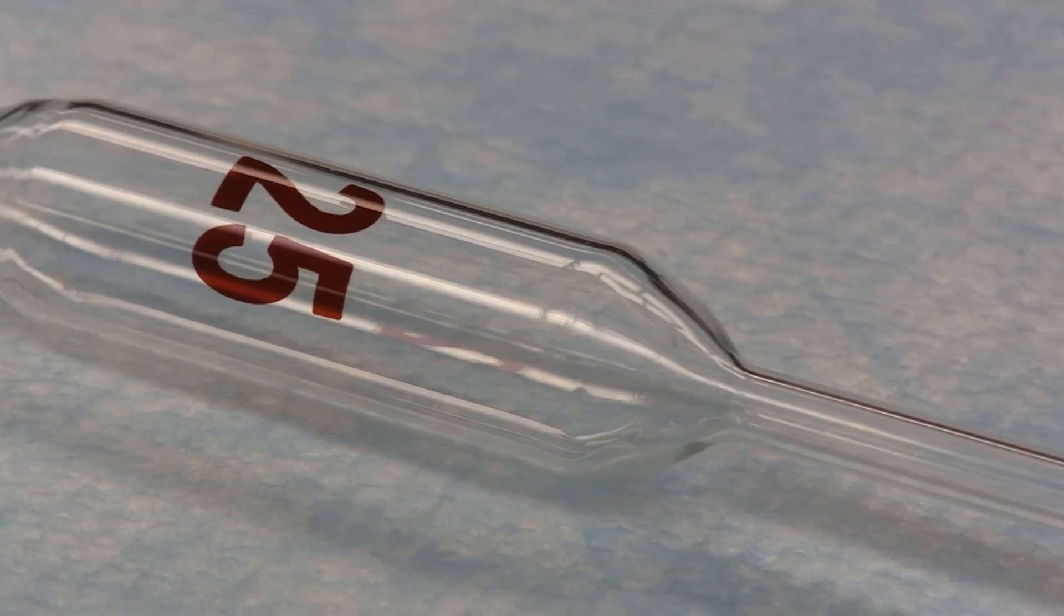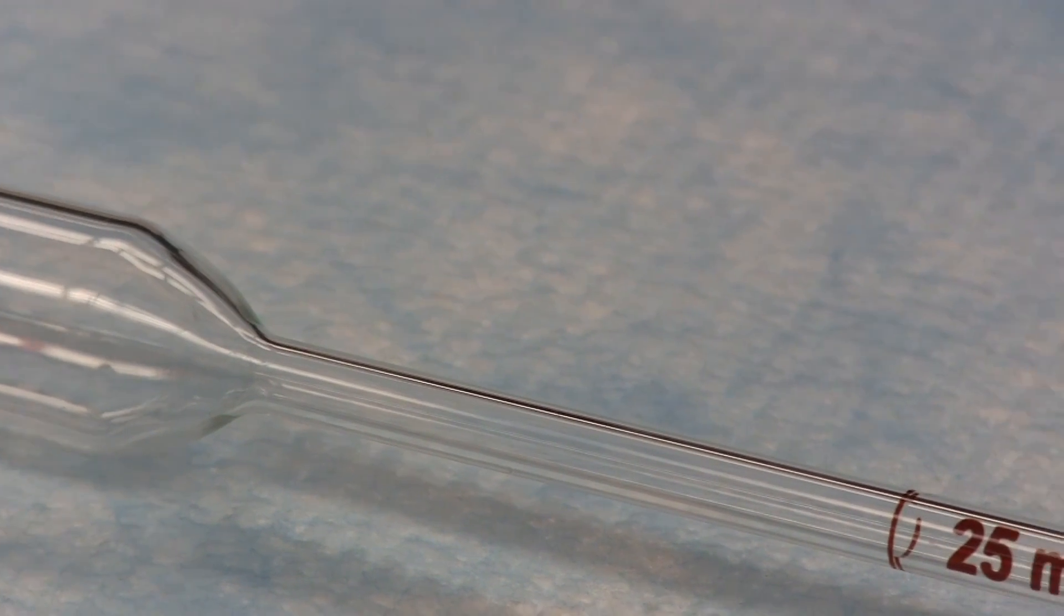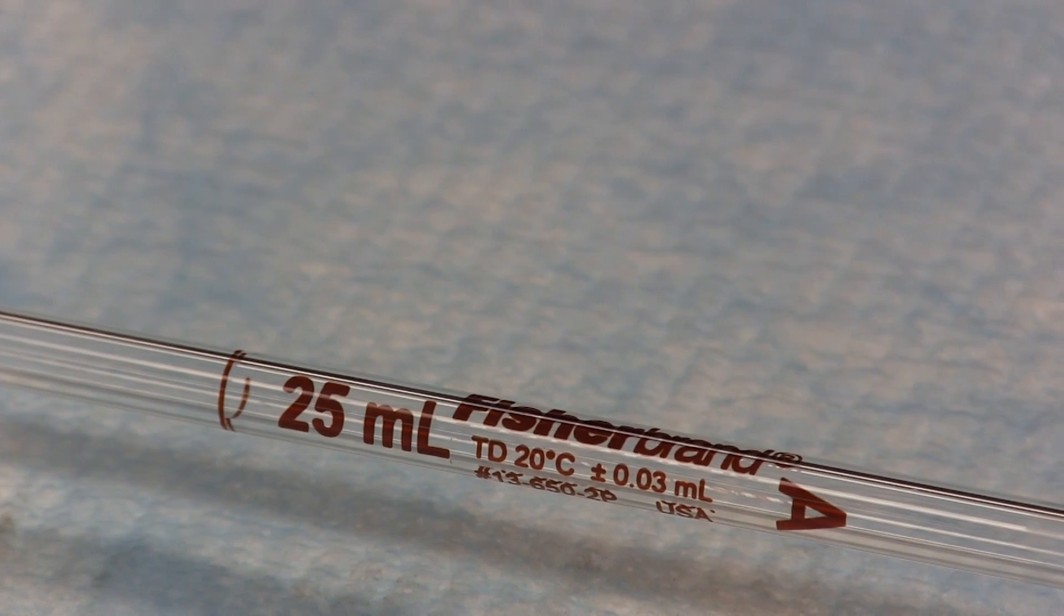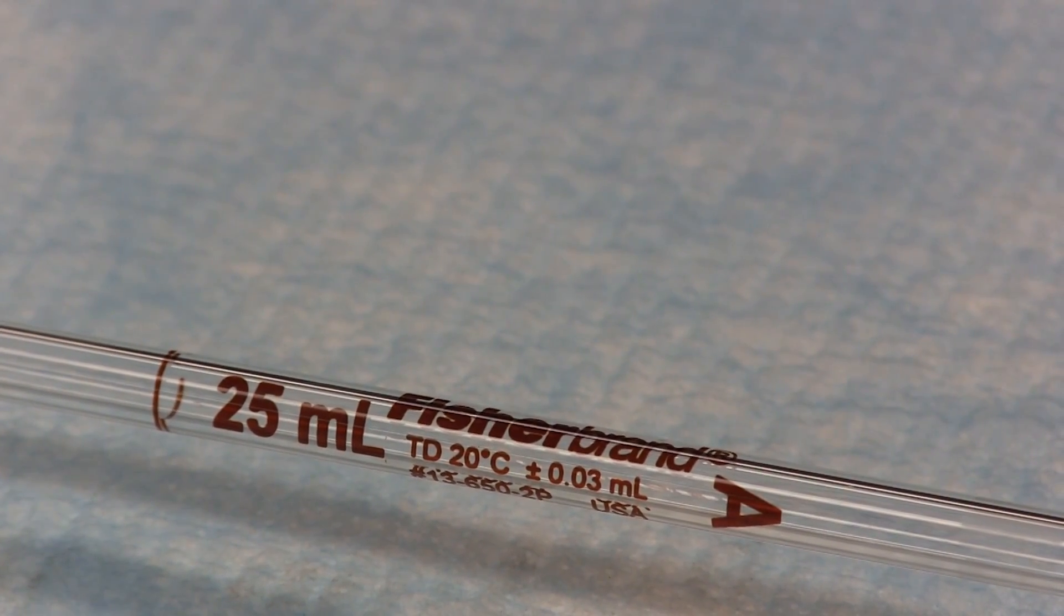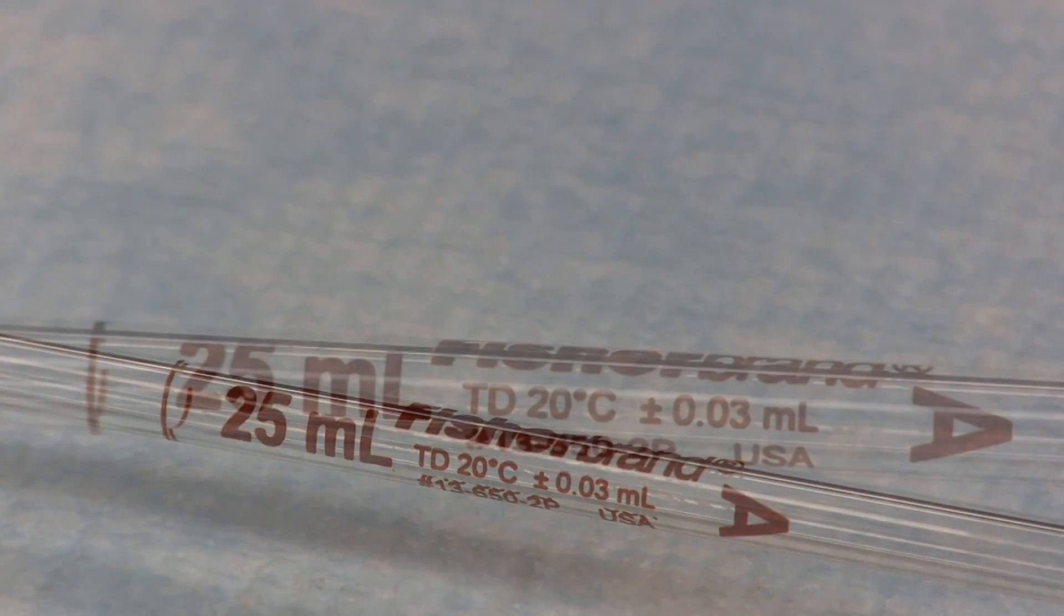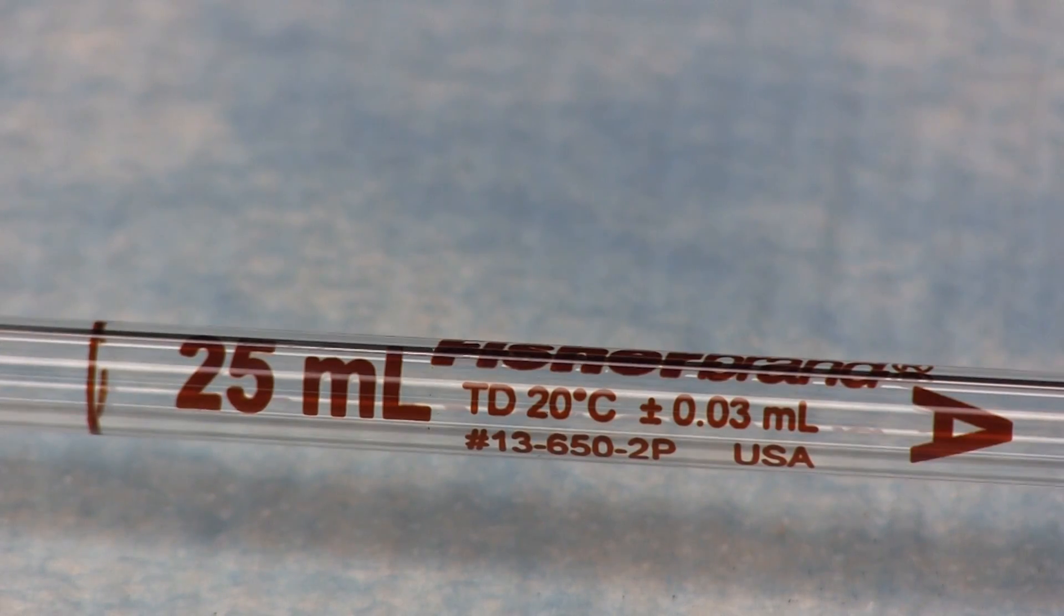This pipette is a 25 milliliter volumetric pipette and as shown on the upper stem it's calibrated to deliver 25 milliliters of a liquid. The precision as indicated by the manufacturer is plus or minus 0.03 milliliters.